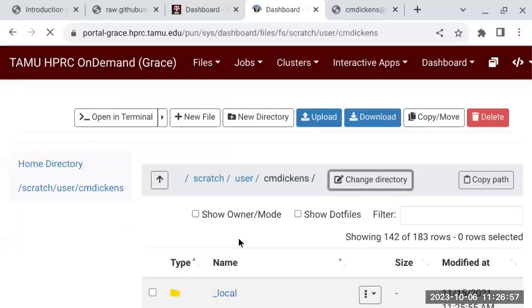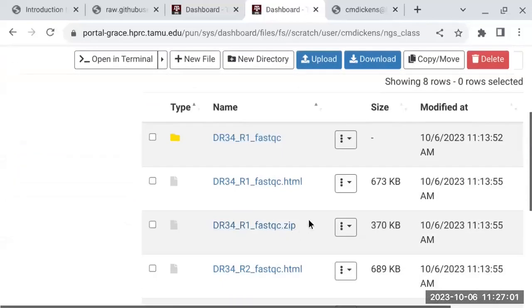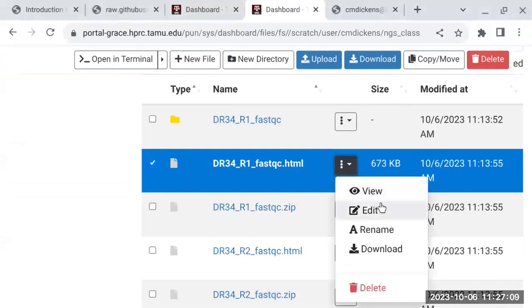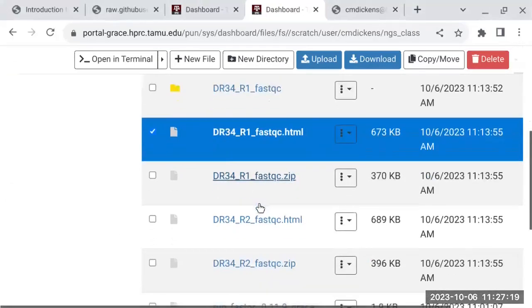Yeah, it might be easier. I have a lot of files. So here, HTML should be able to view. It doesn't show it here. I think you do view here. No. It used to show up HTML. Okay, but anyway, we can view the images.